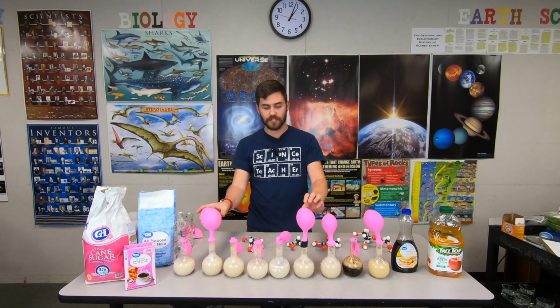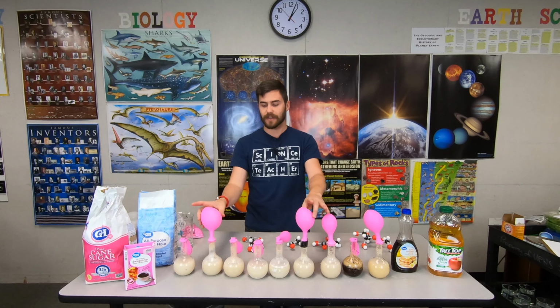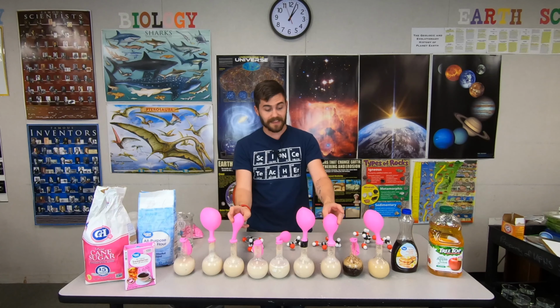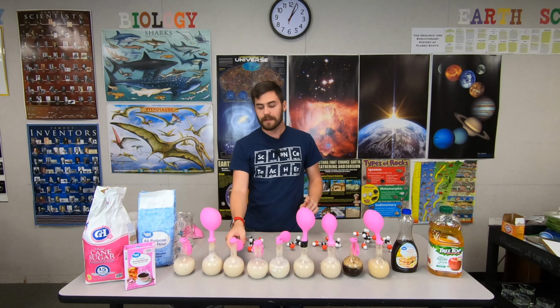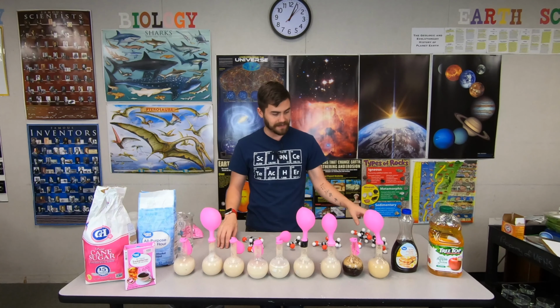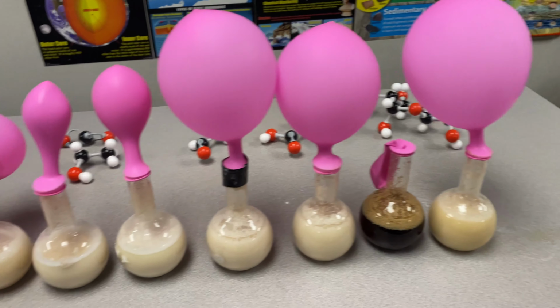I think eventually, because they both had the same mass of carbohydrate, these balloons will get to the same size at some point. And these balloons, I want to believe, would get bigger than these ones over time, but they're still busy breaking down available carbohydrates. Hey, I let these sit for an additional hour and a half, so let's talk about what we have here.